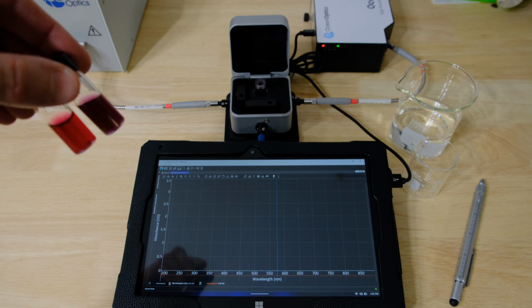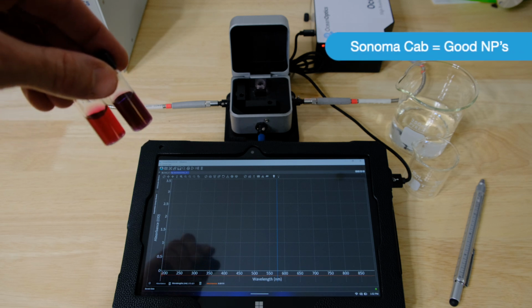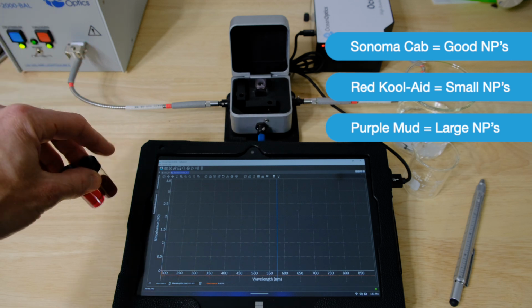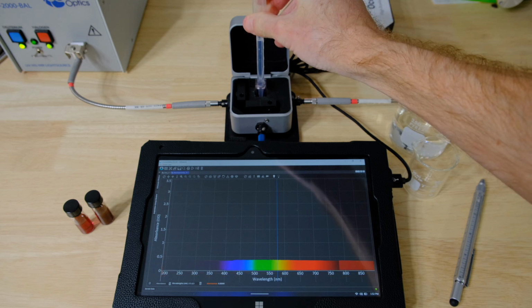Now you want the color for these to essentially be like a good Sonoma cab, maybe like an '08 cab is what you're going for. If it's too red and like Kool-Aid, that's no good, and if it's too dark purple and starts to get murky, that's no good either. So let's take a look at these by putting in a little bit of solution.